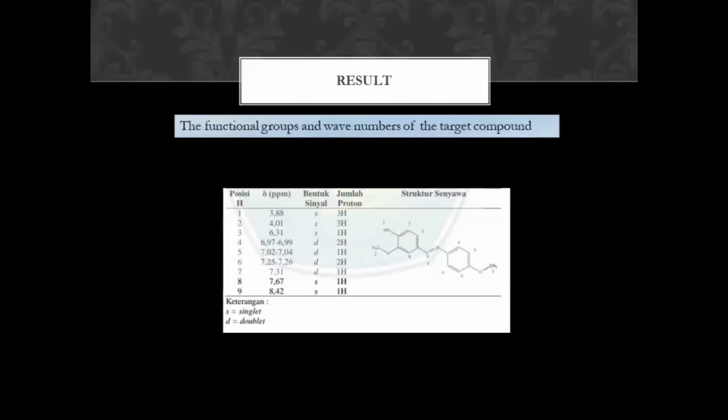and 7.25 to 7.26 ppm 2H doublet, 7.3 ppm 1H doublet, and 7.67 ppm 1H singlet.